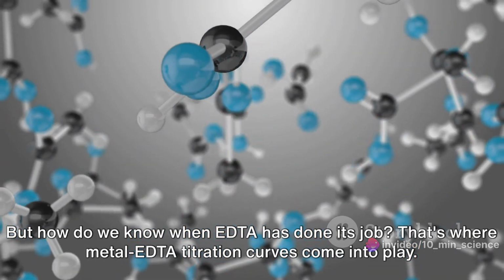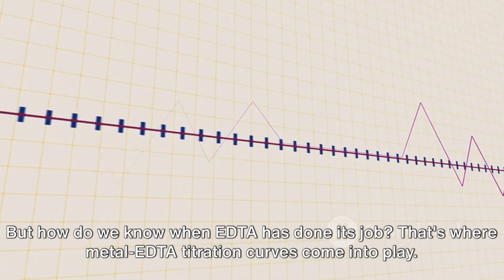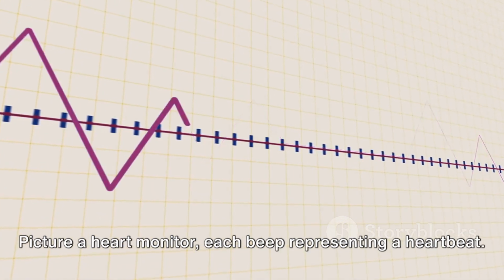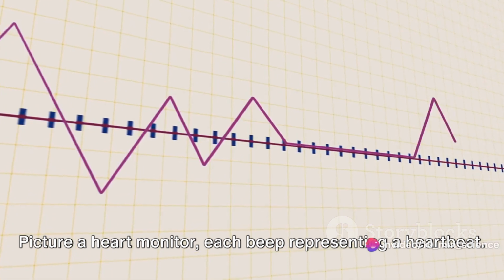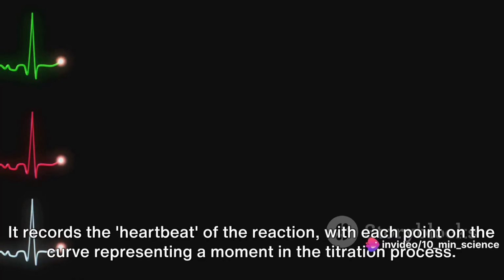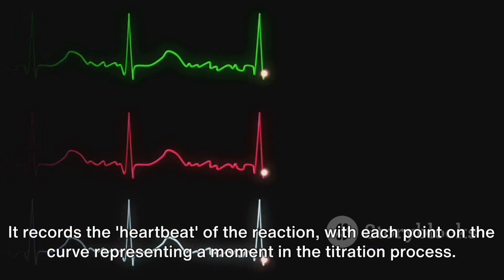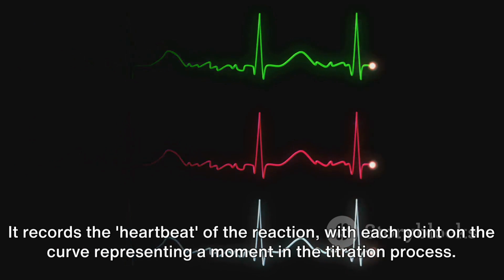But how do we know when EDTA has done its job? That's where Metal-EDTA titration curves come into play. Picture a heart monitor, each beep representing a heartbeat. A Metal-EDTA titration curve is somewhat similar. It records the heartbeat of the reaction, with each point on the curve representing a moment in the titration process.